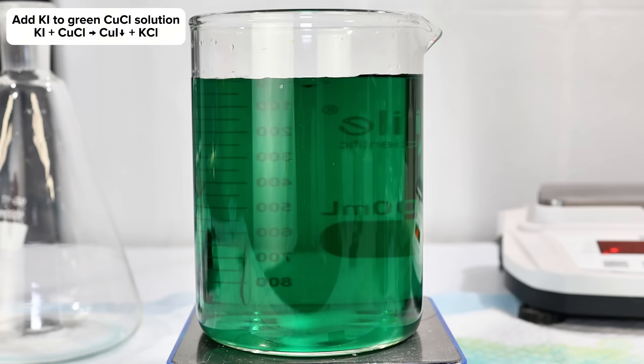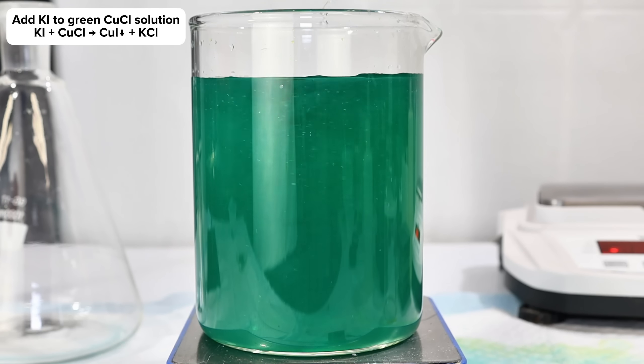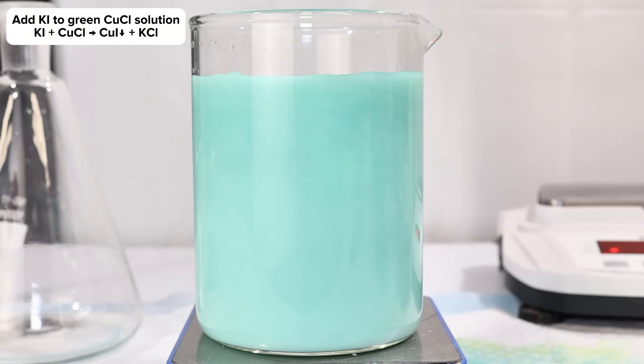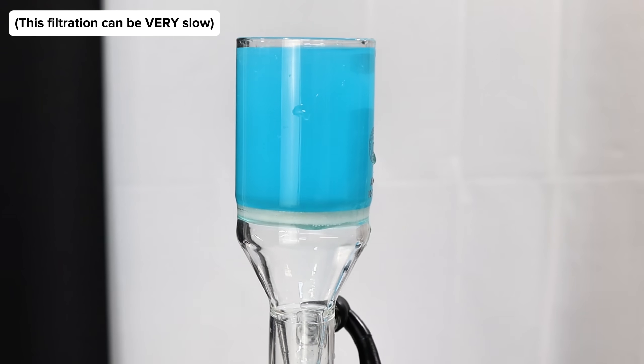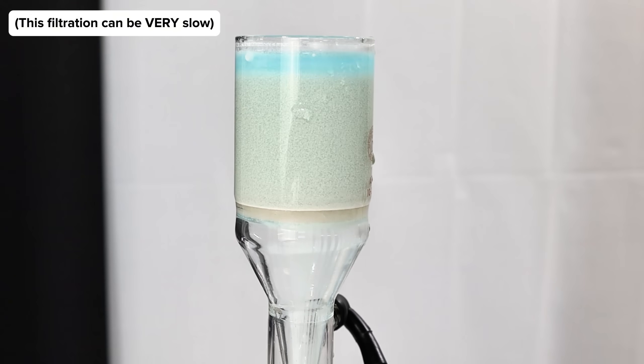To this, I slowly began to add a saturated solution of potassium iodide. As soon as the potassium iodide was added, a dense white precipitate of copper iodide began to crash out. This was continued until the white precipitate had began to slightly darken, indicating that all the monovalent copper ions had been used up and iodine had begun to form. The iodine was removed by adding a bit more copper chloride back to the mix, and once the precipitate had completely whitened, I collected it all by vacuum filtration.